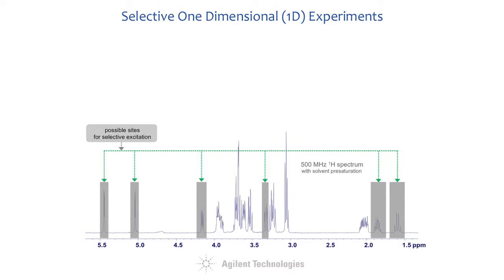Therefore, these powerful experiments can only belong to the routine repertoire of an NMR lab if their setup is quick, straightforward, does not require extra calibration steps, and can be run by operators with little NMR or instrumental background. Agilent's VNMRJ3 software is fully compliant with all these criteria.